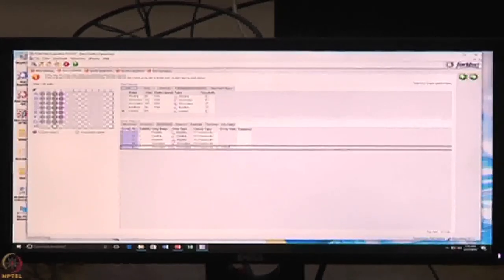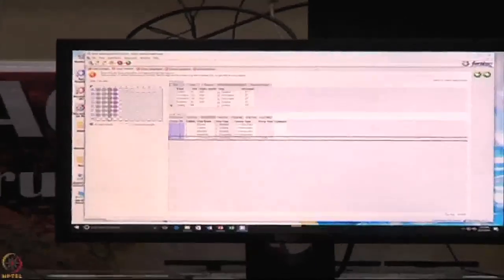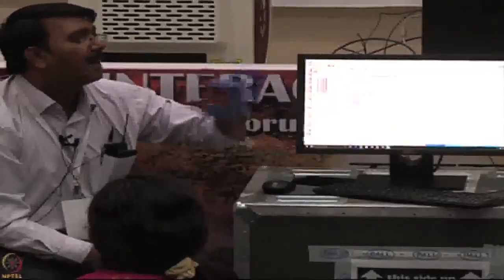This SPR step has to be based on the experience you have. It's not fixed. The general assumption is a minimum of 300 seconds, or 200 seconds, that we put. So I have put 300 seconds. But in the beginning I mentioned that the software has an option where I can jump to the next step.